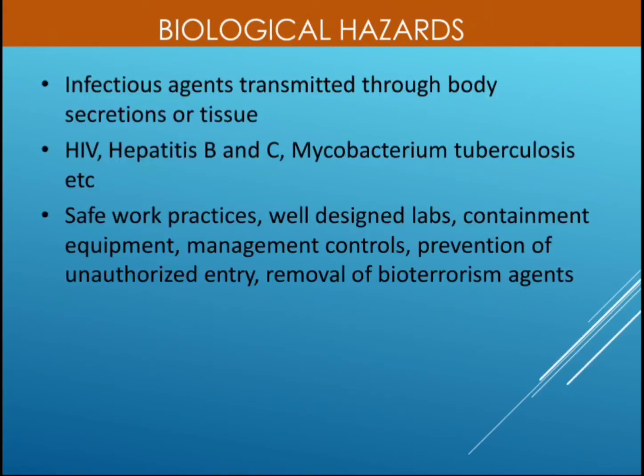Then biological hazards: infectious agents transmitted through bodies, secretions, or tissues. These are the biological hazards: HIV, hepatitis B and C, Mycobacterium tuberculosis, etc. These samples are the biological hazards.